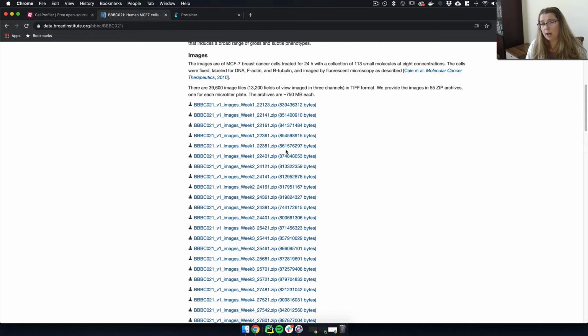It would take the rest of your life. Your paper would never get out. It would be bad for everybody involved, right? So this is what you want to do. This is why you would start to batch your analyses. And what batching usually is, is you're running things in parallel.